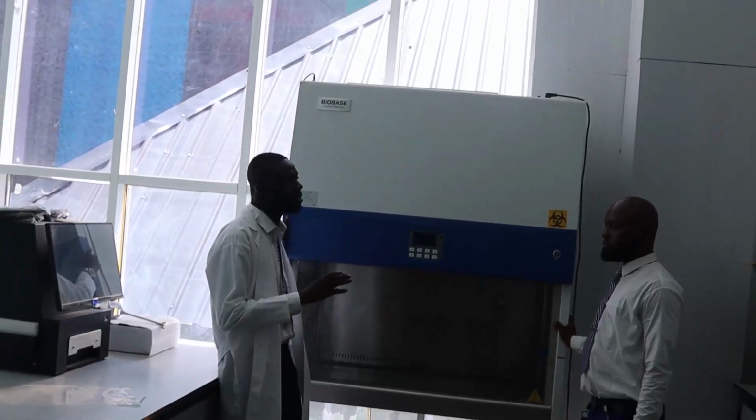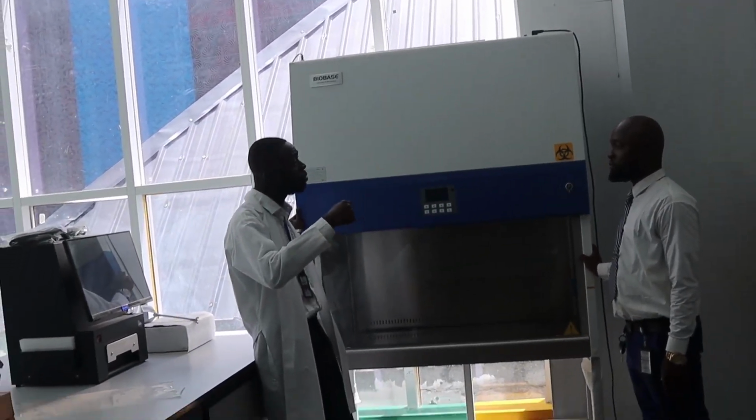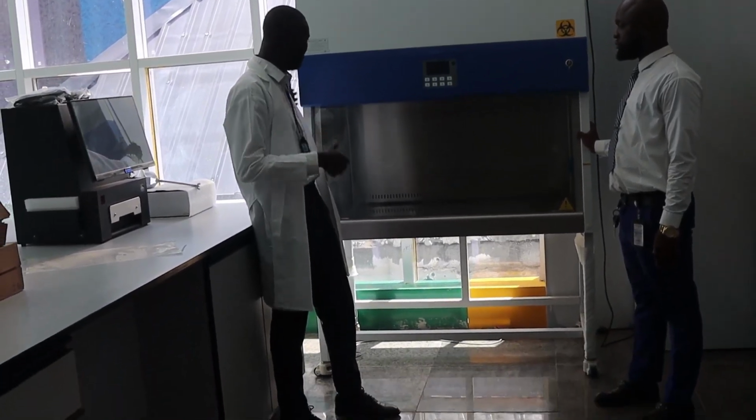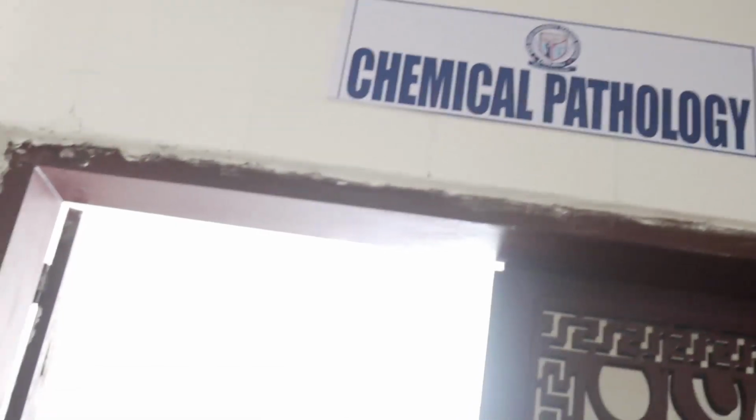There are certain procedures you want to carry out, and you need to ensure that you, as a scientist, are safe first of all. This is a biosafety cabinet, used for high-risk procedures, like where we are identifying acid-fast bacilli. This is the chemical pathology unit.